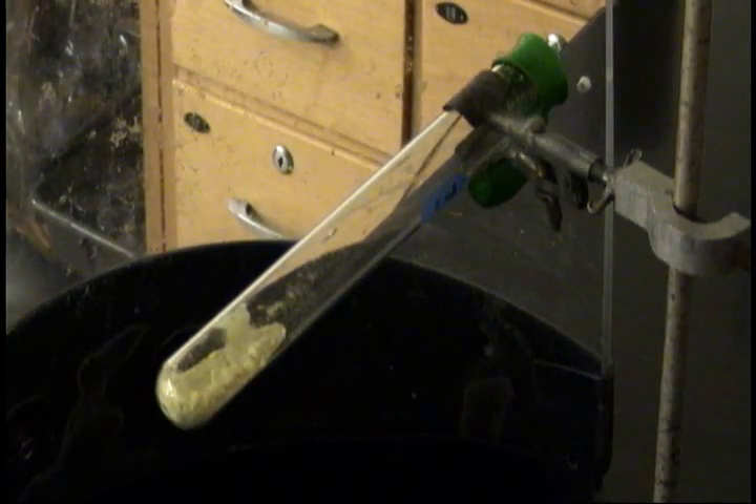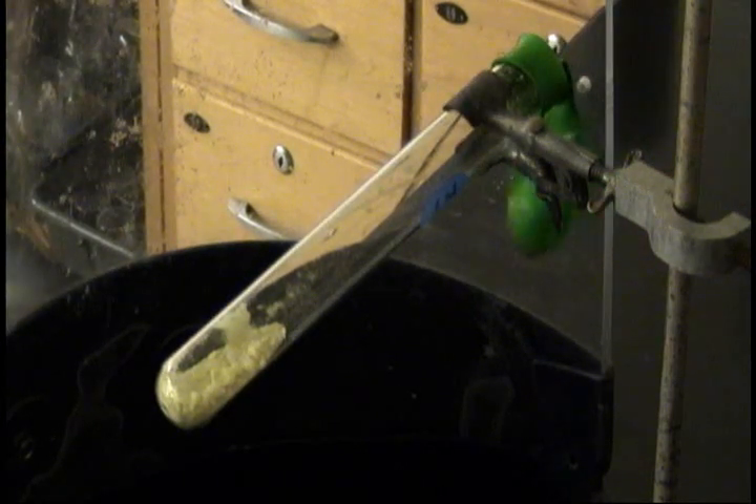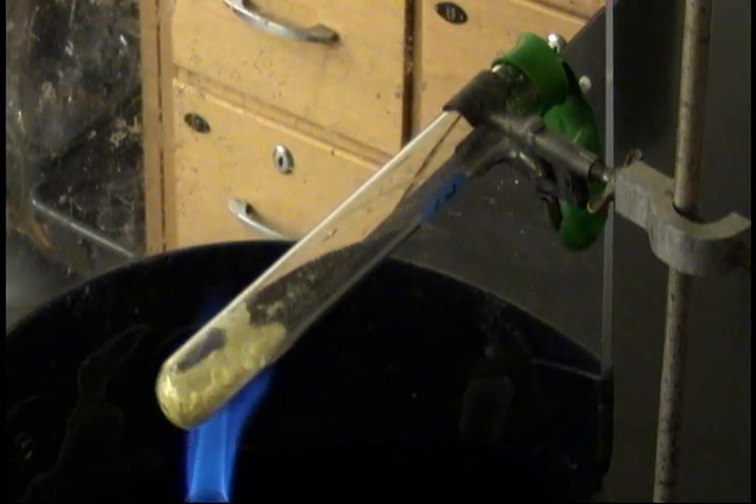Now we're going to light it in its container on the ring stand. The trick is, as soon as the sulfur begins to ignite, remove the flame, and then watch what happens. Very carefully.